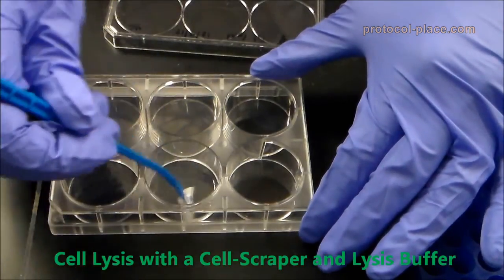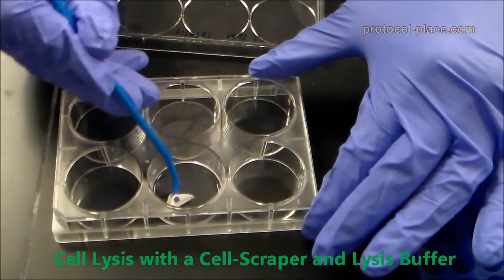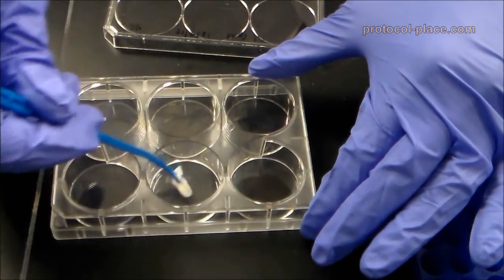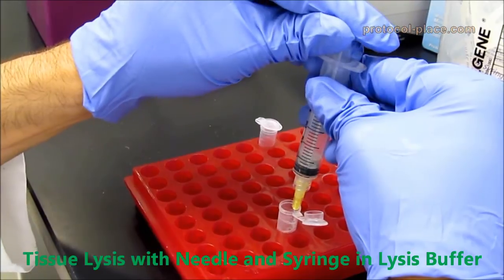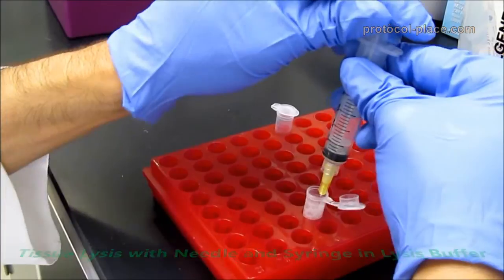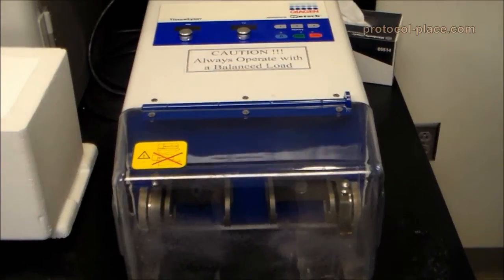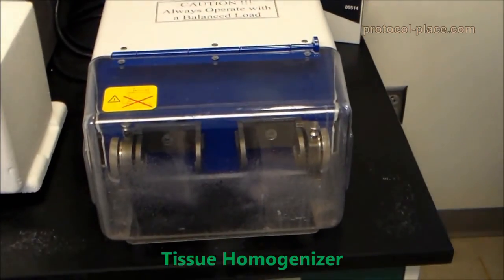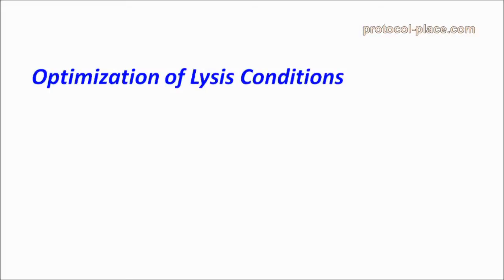Cell lysates can be obtained using a cell scraper and a small volume of lysis buffer, while tissue samples require different types of homogenization, depending on what type of tissue you are working with. Here, I am simply using a needle and a syringe to homogenize some fragile collagen gel samples. Tougher samples might require snap freezing and disruption with other equipment, such as the tissue lyser shown here.